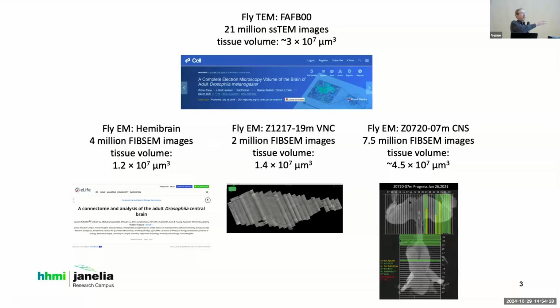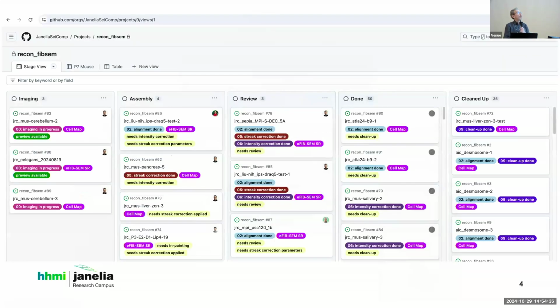Now, just getting from these initial images to where we start doing proofreading and automatic segmentation requires a lot of effort. So I'm just going to briefly describe some of these initial stages, which would be going through all the data, figuring out where there are errors, figuring out where there are artifacts, how to look at all this stuff. One interesting aspect here is that the people involved in doing this found that GitHub is very appropriate, that you can actually do issues, you can track things. So it's very useful in terms of setting up a pipeline and then labeling what kind of problems might be occurring. So that might be useful to you. Or we can also put you in contact with the people that have set up a methodology for this.